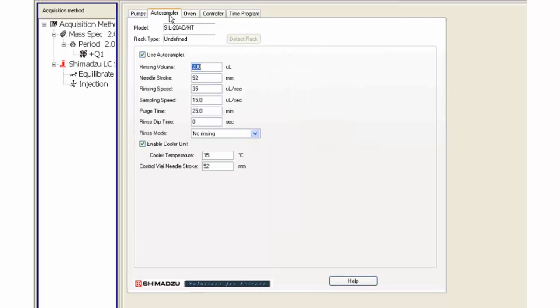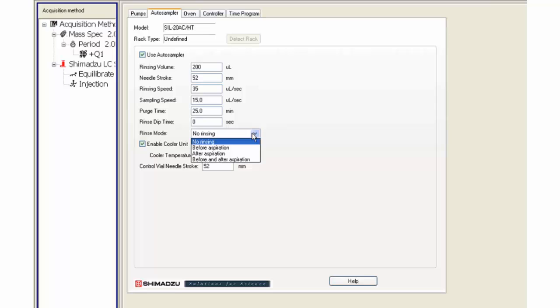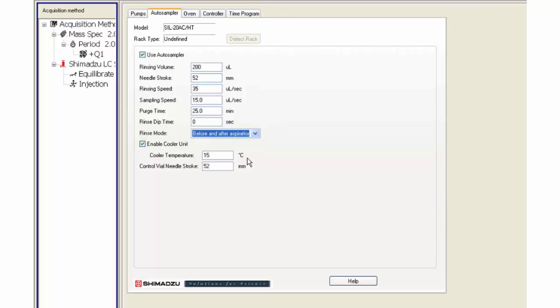Click on the auto sampler tab. Change any settings needed. In this example, the before and after aspiration rinse mode will be used to help lower the carryover.